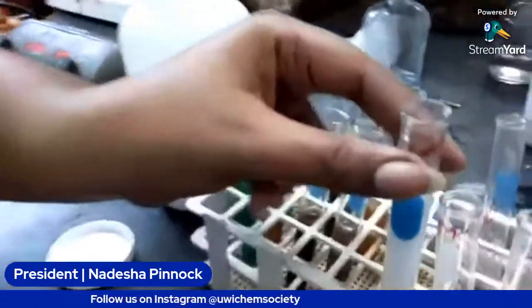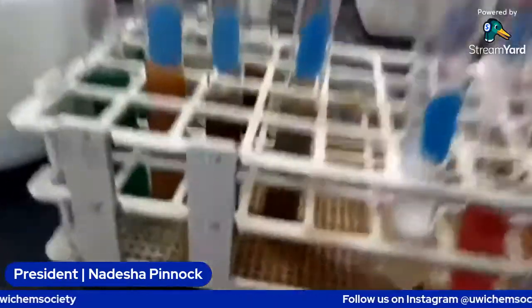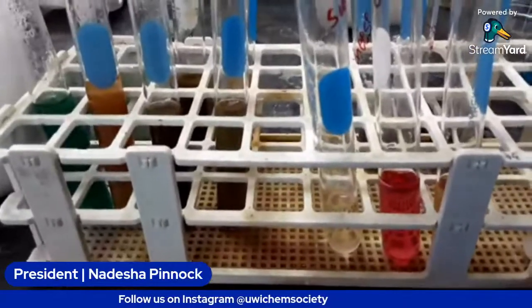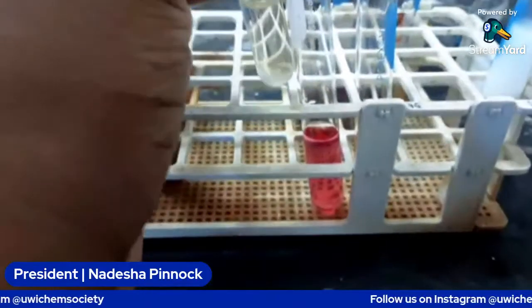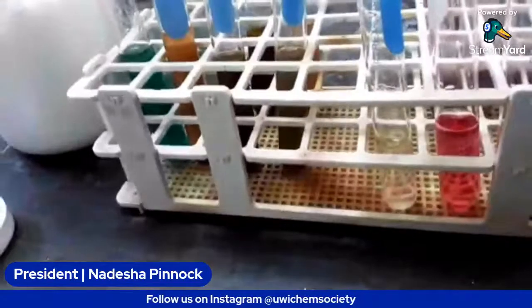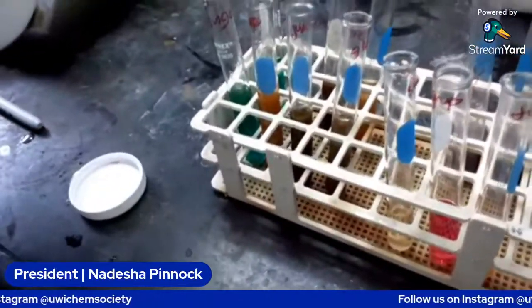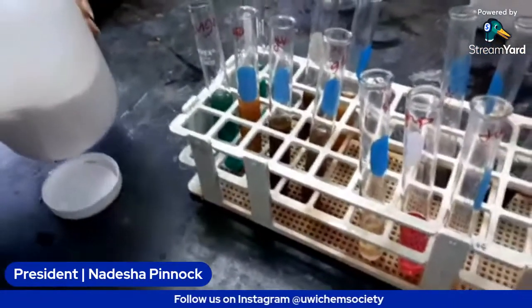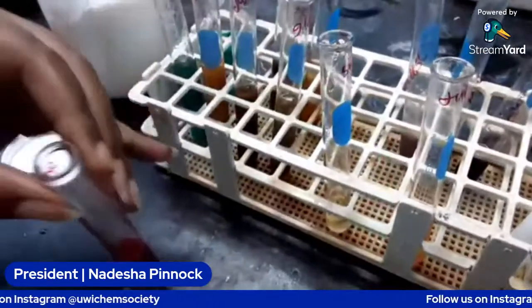As you can see, there's a lot of fizzing. So we'll probably add smaller amounts each time. That's obviously because the acid is reacting with it. Hopefully this will not go over.